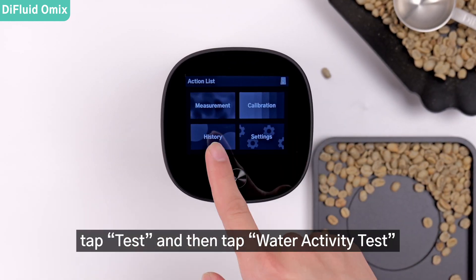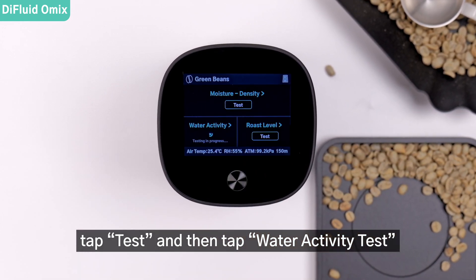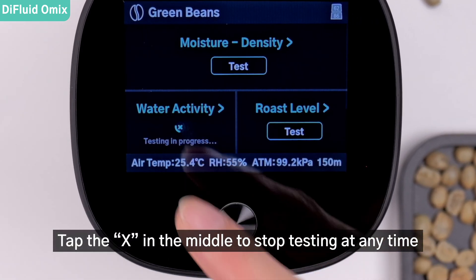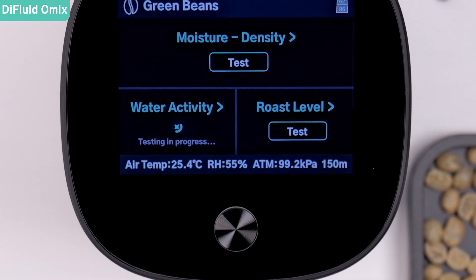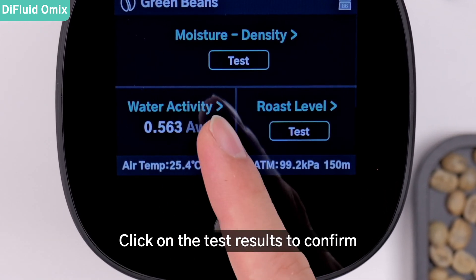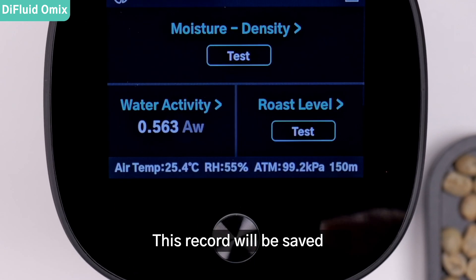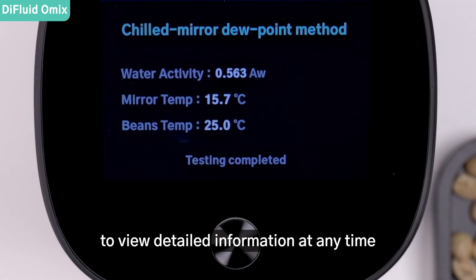Cover them with the main unit, tap test, and then tap water activity test. This process takes about 30 seconds. Tap the X in the middle to stop testing at any time. Click on the test results to confirm the mirror temperature of the machine and the test sample. This record will be saved, and you can tap on the target data to view detailed information at any time.